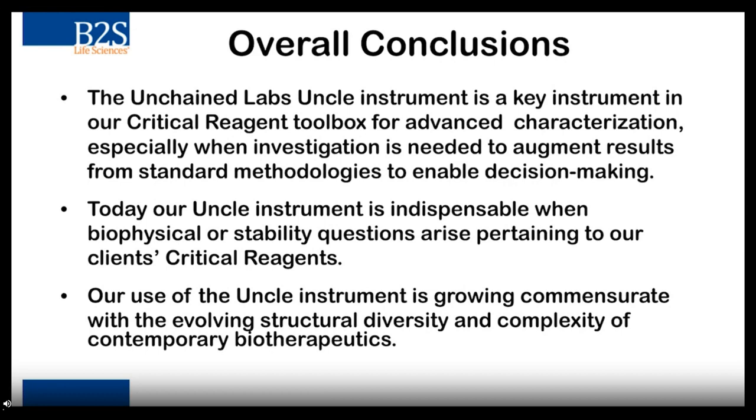So that leads us into our overall conclusions, which as you've seen over the course of the last two case studies, the UNCLE instrument has on many occasions proved to be a key instrument in our critical reagent characterization toolbox for our advanced characterization activities. And this especially comes into play when such investigations are needed to augment or sometimes even replace more traditional characterization methods.